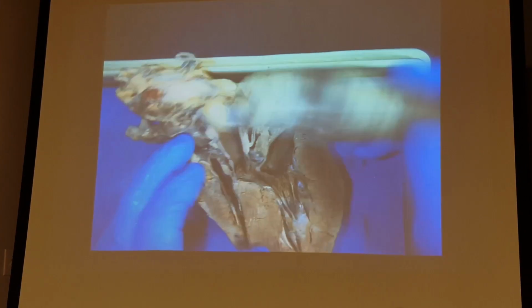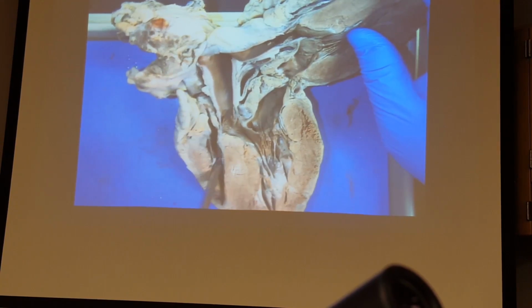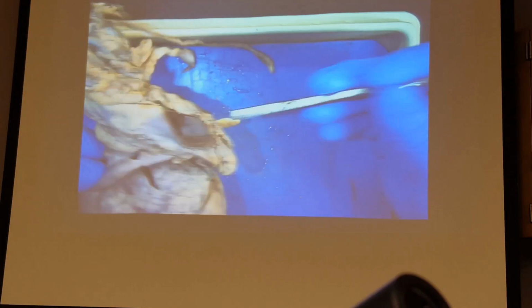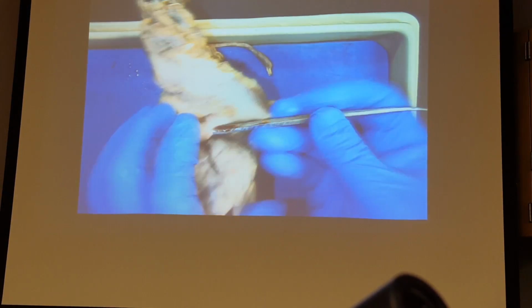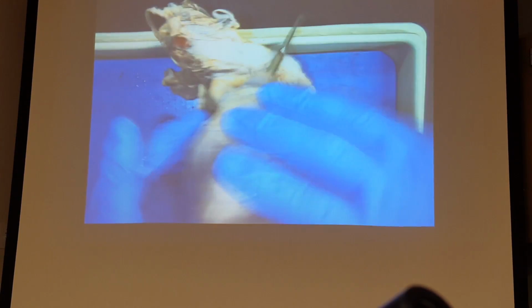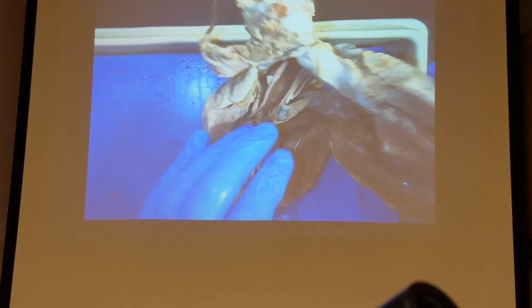Okay. The only other vessel or valve we could talk about is what if I stick this probe in the right ventricle and I come out the pulmonary trunk. I can do that. There we go.